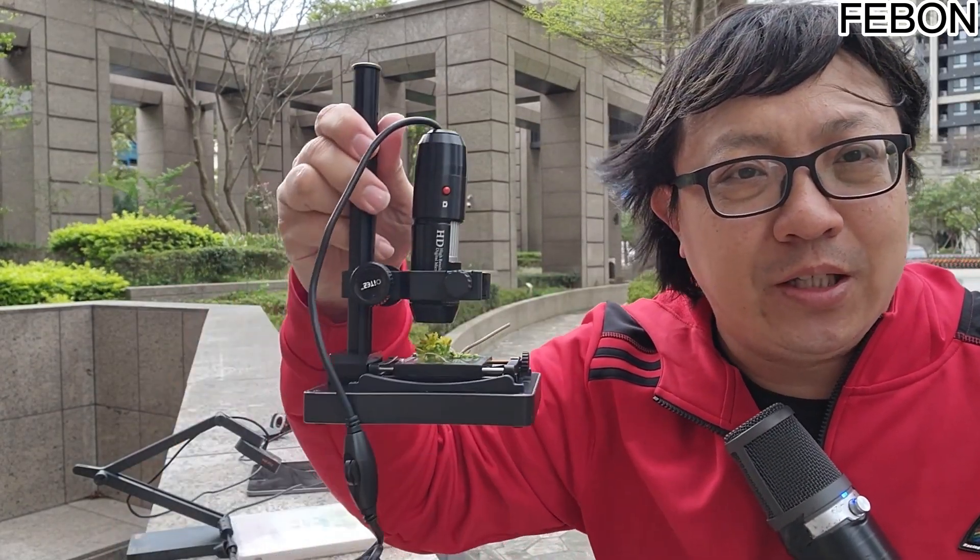Hello, everyone. When we are teaching outdoors, what we hope most is to be simple. If we now use this kind of microscope in outdoor teaching, wow, then you will have a very big headache.